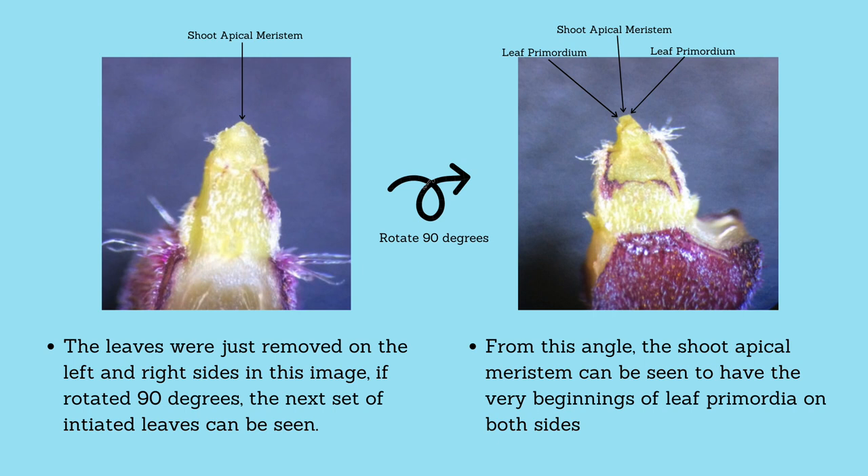This is because the very beginnings of the next leaf primordia have been initiated and can be seen as small outcroppings on either side of the shoot apex, appearing like a little Mickey Mouse head.